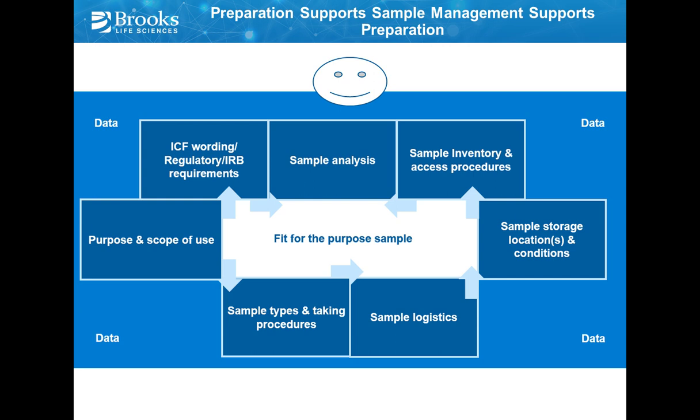Yes. So I call this slide Preparation Supports Sample Management, Management Supports Preparation. And that's heading in the direction that we are looking for samples that are really best fit for our purposes. Especially if we want to use the samples for broader research later on, want to store them for a long time, it's really important to focus on certain aspects that may help us to generate the quality, to have the purpose of use and the scope of use in place we need later on, maybe many years later on, and to stay compliant with our sample and sample usage.